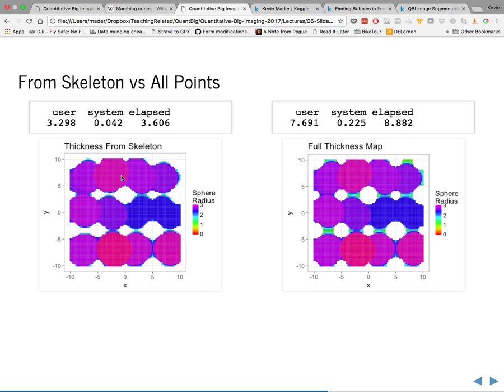So where the problem would come in would be if you were trying to really quantify, this is how many bubbles we have that are this radius, and this is how many bubbles we have that are this radius. If you were to try to reverse calculate that to the number of bubbles, that would potentially not work very well. But when you're actually doing this labeling, you don't delete or remove or separate it. You just have this bubble kind of invade into pixels that you might have assigned to that bubble, depending on what rules you had.